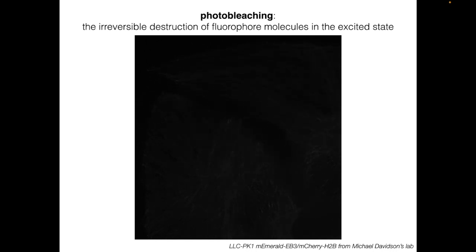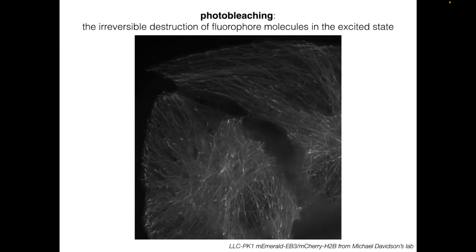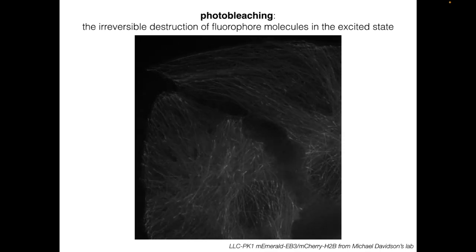There are two key things to know about photobleaching that will help you design your experiment and choose appropriate fluorophores. First, photobleaching requires excitation. If you are not exciting your fluorophores, they won't photobleach. On the other hand, any time you excite your fluorophores, photobleaching will happen. For example, if you're staring at your gorgeous samples through the eyepieces with the fluorescence illumination on, you are exciting fluorophores, and some of them are photobleaching.